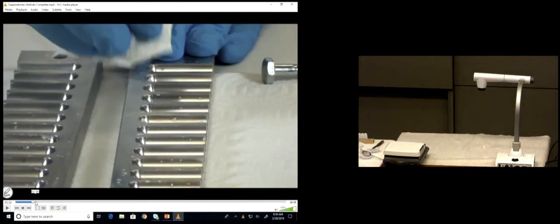There should be 2 aluminum molds. So grab one of the aluminum molds, open them up, and just take a paper towel and dry wipe them out. Just make sure there isn't stuff in there already, because if there are some particles in there already, where do those particles end up? In your suppository. So just clean them out quickly. Don't get them wet. We don't need to spray them. Just make sure that they're clean and dry.